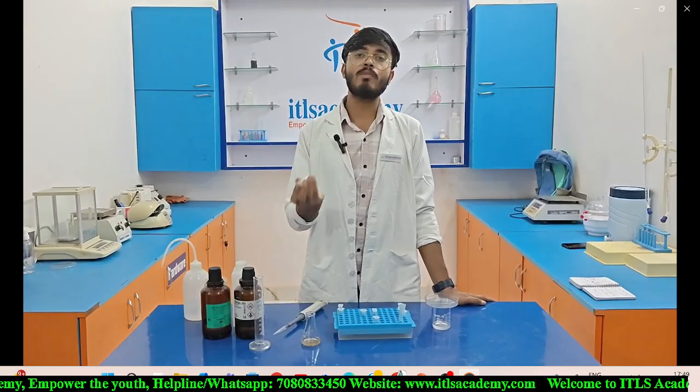So as you can see, these are the pellets and this is the supernatant. Now again I'm going to discard the supernatant. Discard it very carefully so the pellet should not be harmed, and after discarding the supernatant, we need to add 600 microliter of isopropanol. So here I'm going to add 600 microliter of isopropanol in each of the Eppendorf tubes.